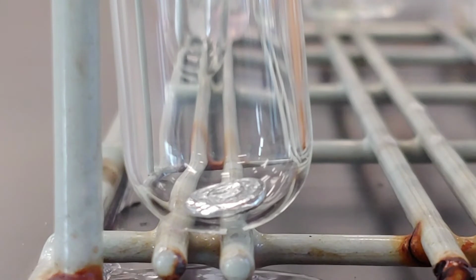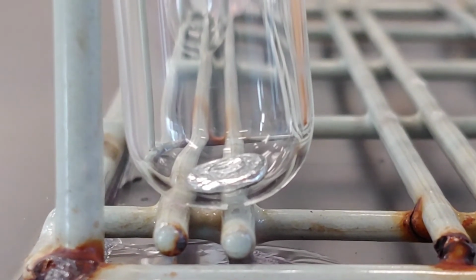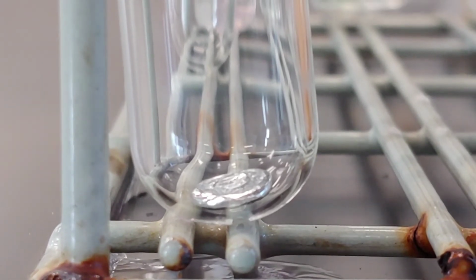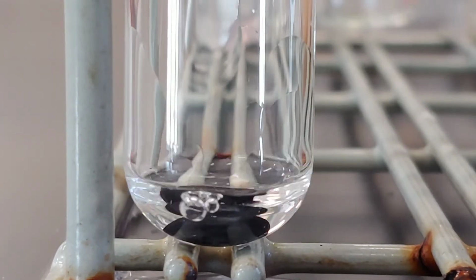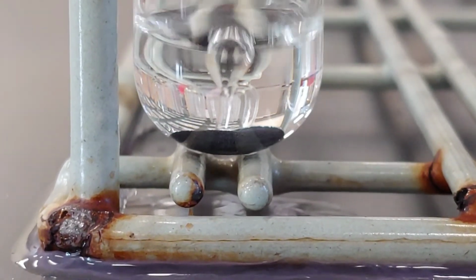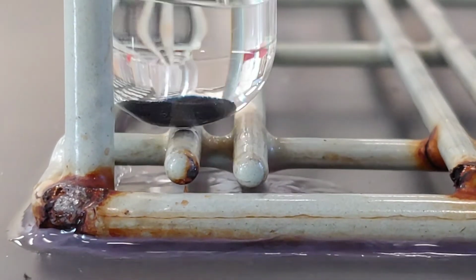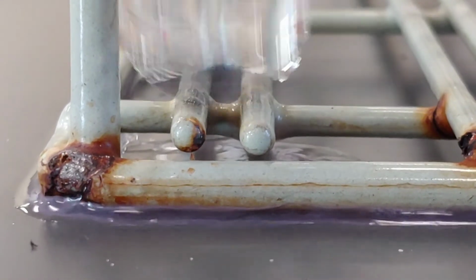Okay, reaction number 11, zinc metal, which is there in the test tube. And I'm going to add aqueous lead-2 nitrate to that. Appears that my zinc has changed color. It's not shiny silvery anymore.